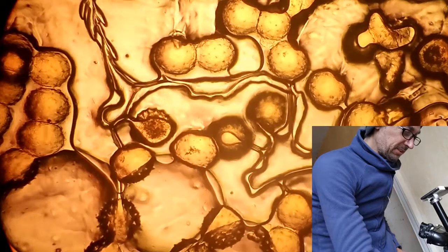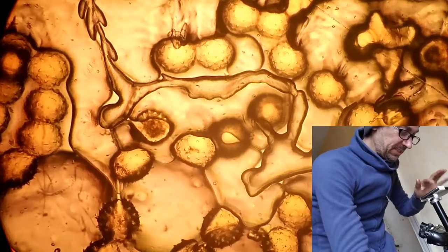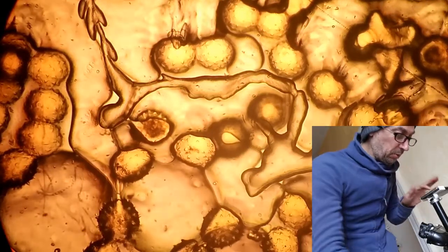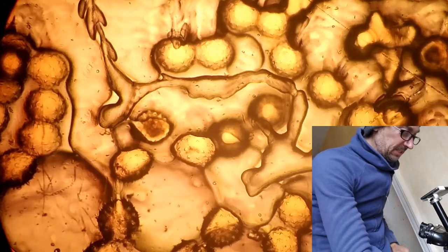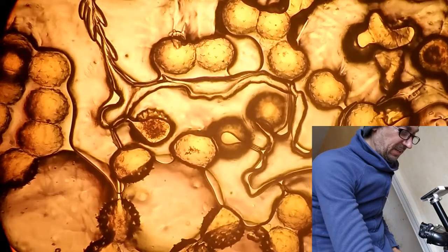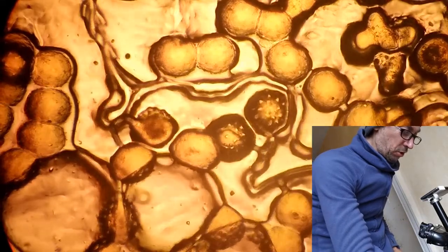If you choose another focus, you see the pollen below come into focus, which we could not see with the tiny scope. It's a ball with spikes.